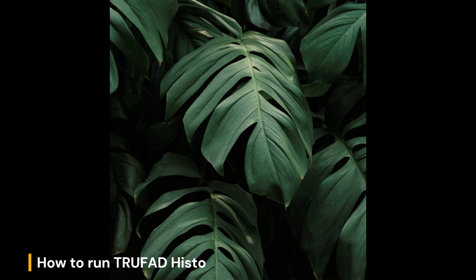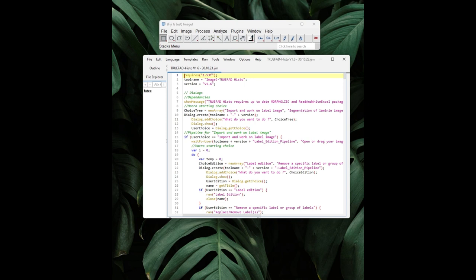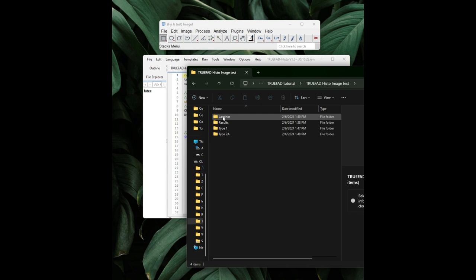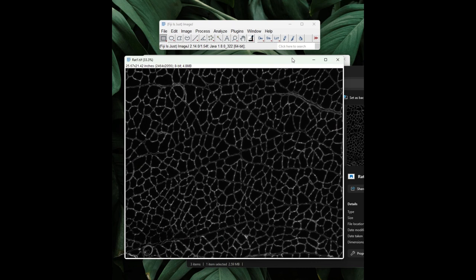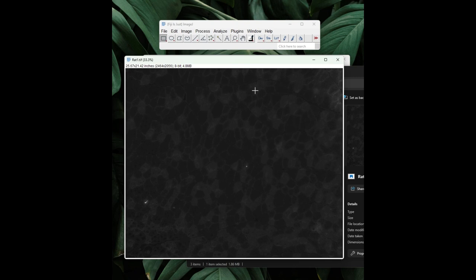The first step for Trufad Histo is to create a folder on your computer for each fluorescence channel, depending on the type of analysis you will be conducting. For example, if you're analyzing laminin, type 1, and type 2a fluorescence for the automatic fiber type attribution post-segmentation, you will need three separate folders. Each folder should contain the corresponding 8-bit single-channel image with the same file name per field of view. Only the 8-bit image files that will be analyzed should be placed in these folders, as you might have issues otherwise.